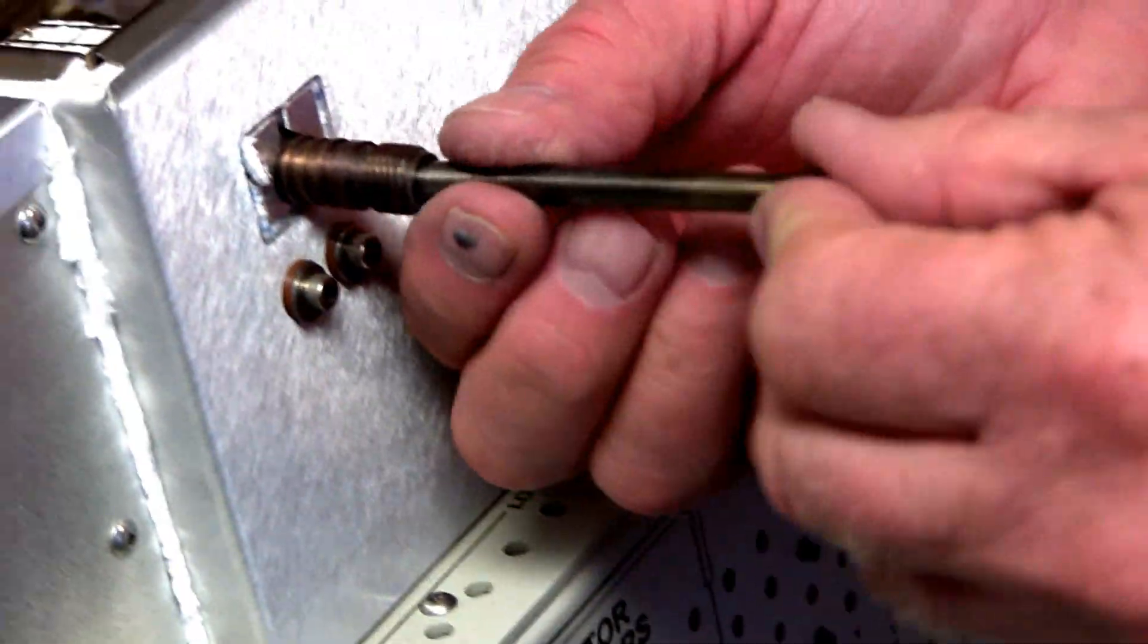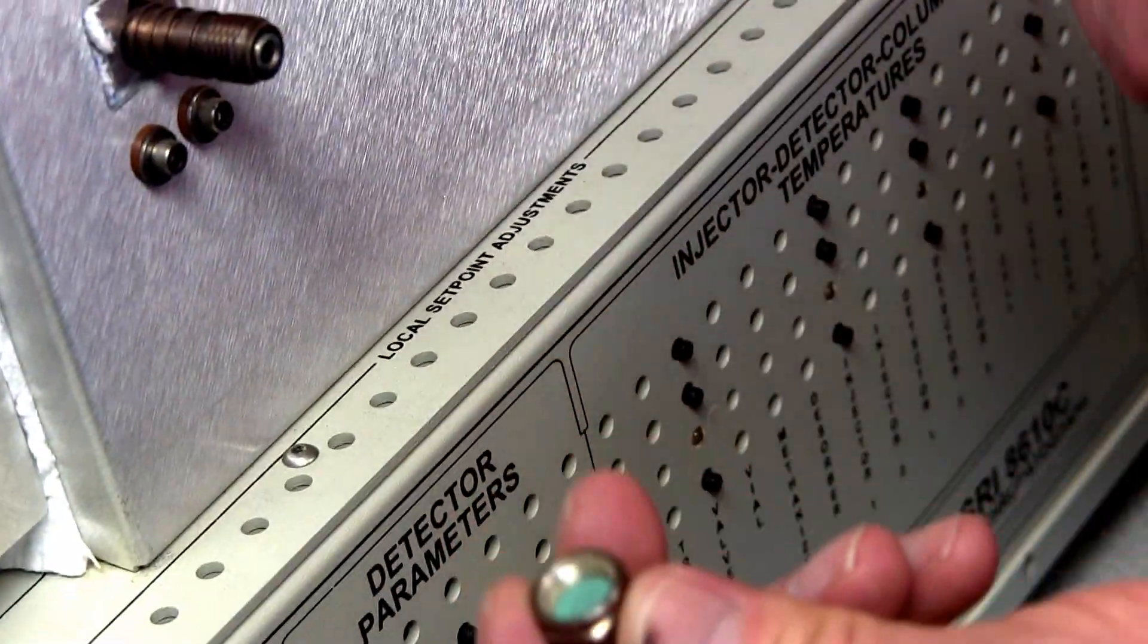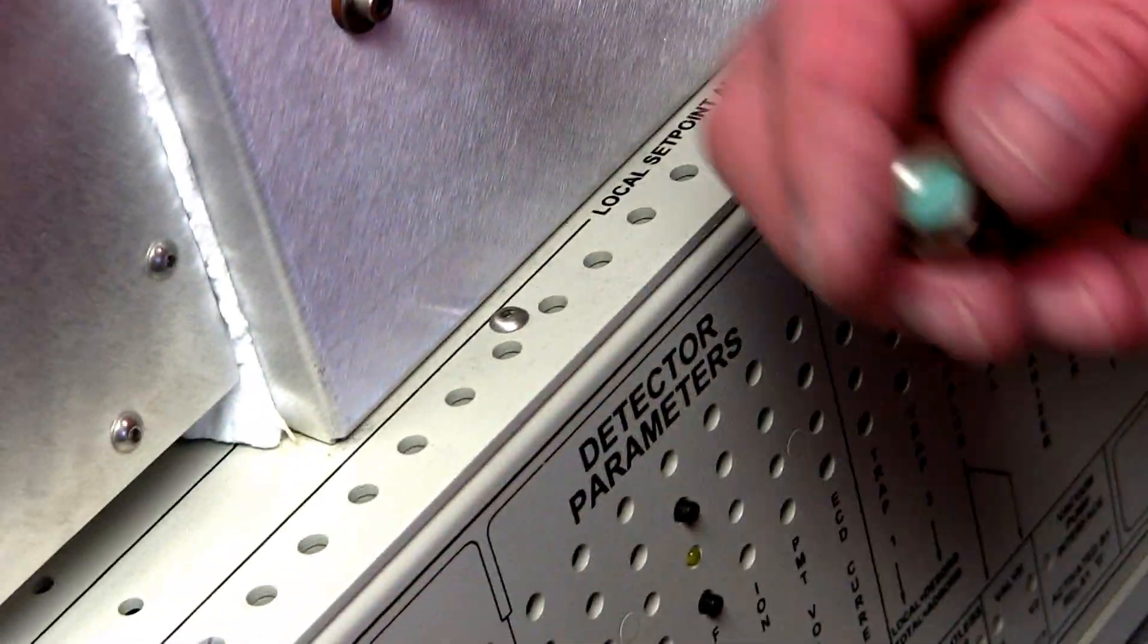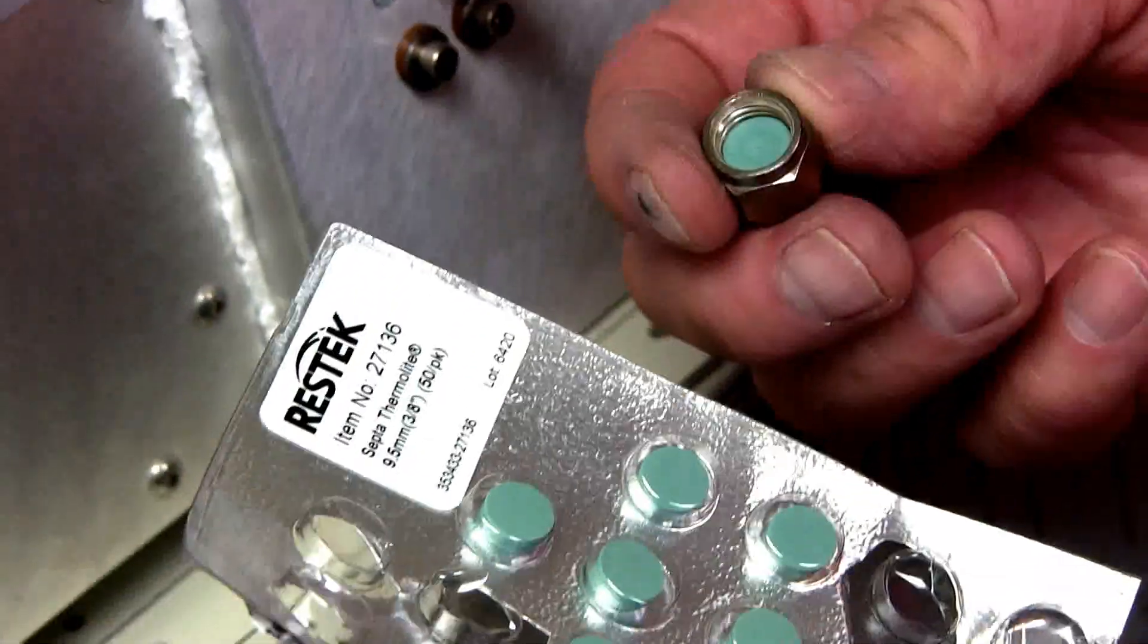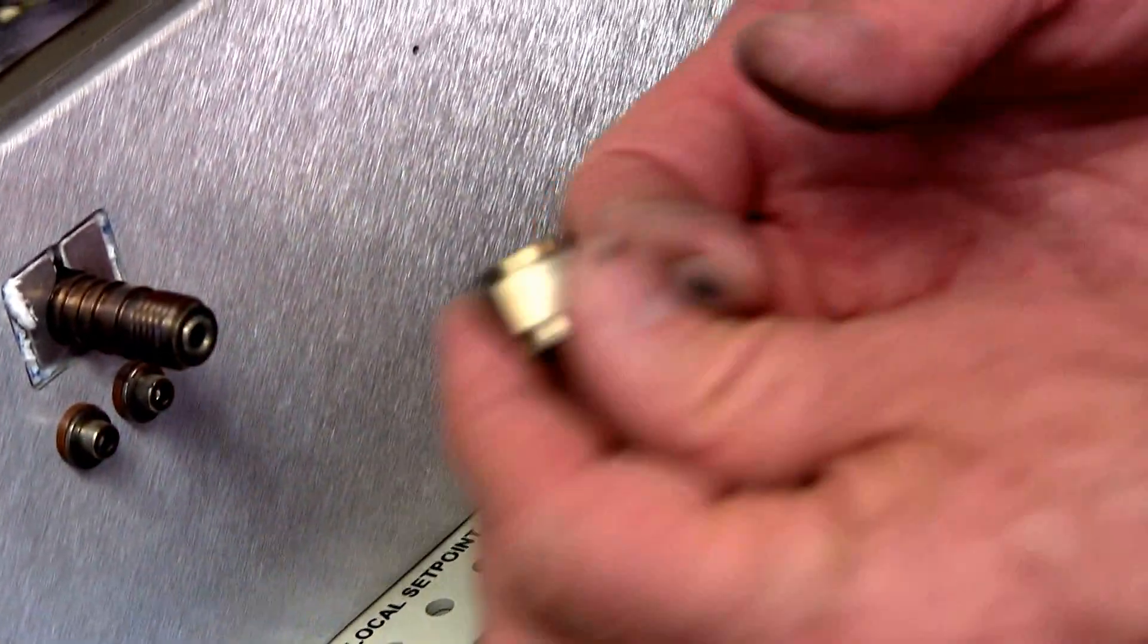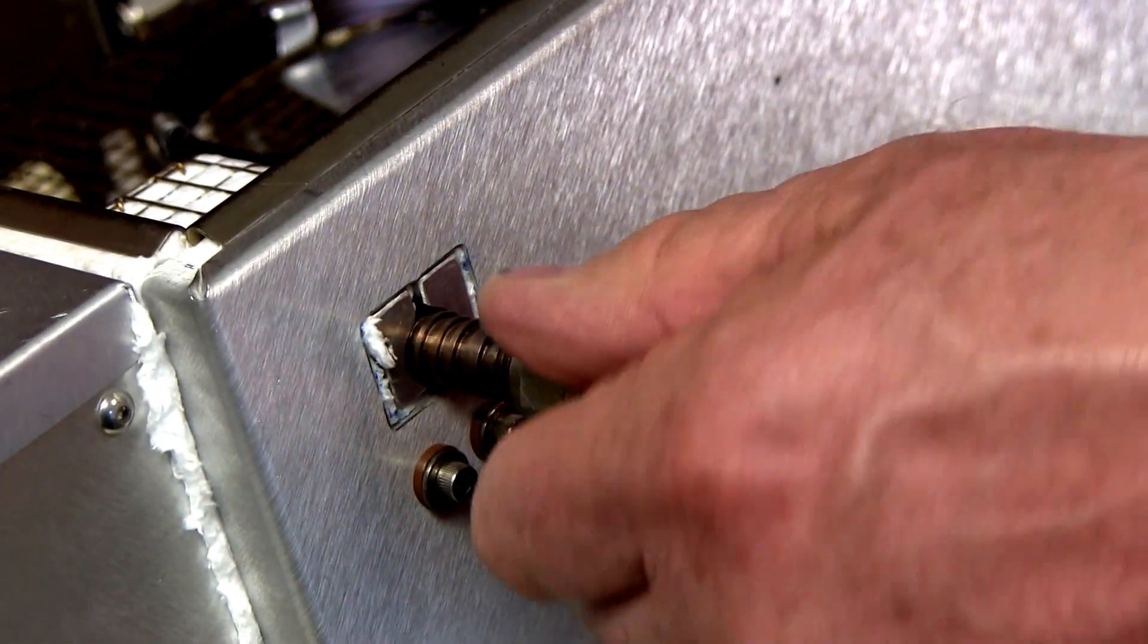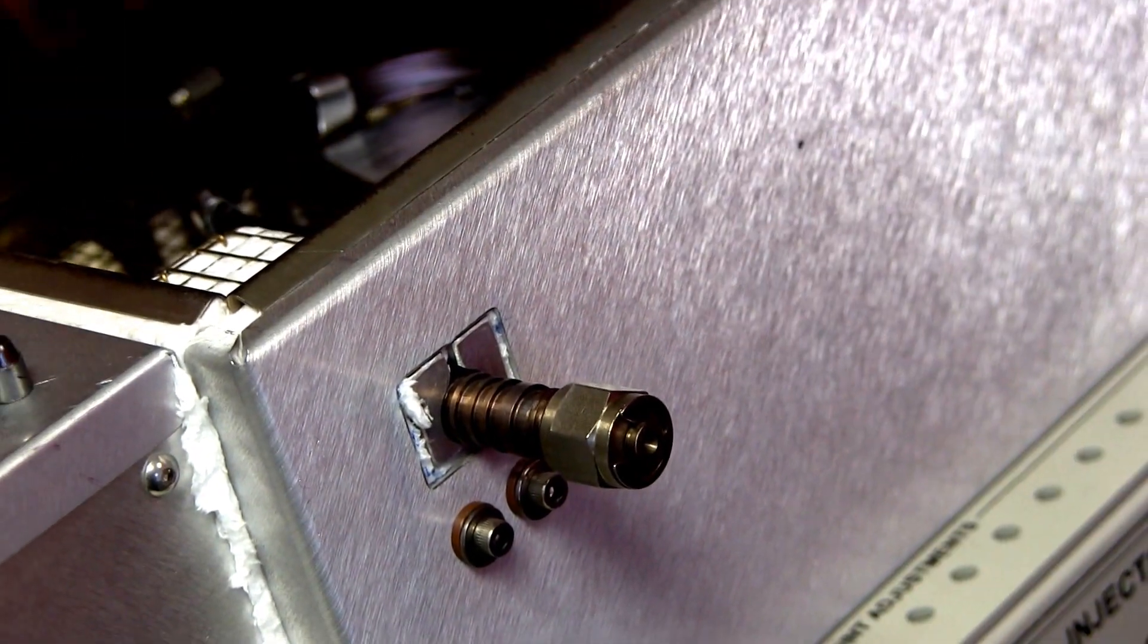Then the liner goes back in with the little hole pointing toward the outside. It's probably a good idea to put in a new rubber septum. This is what they look like when you buy them. They're about a dollar a piece. 9.5 millimeter green septa from Restek is what we use. And then tighten it up finger tight. And we're done on the injector side.